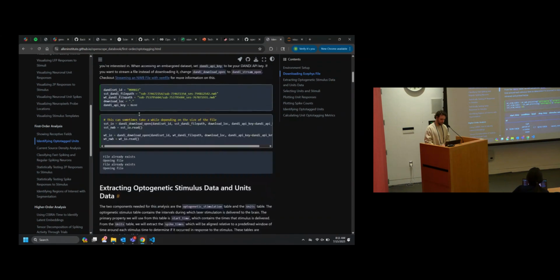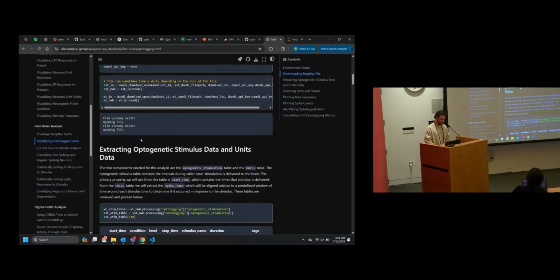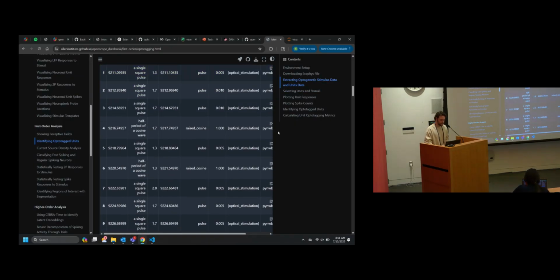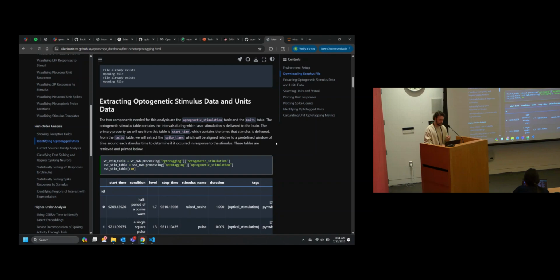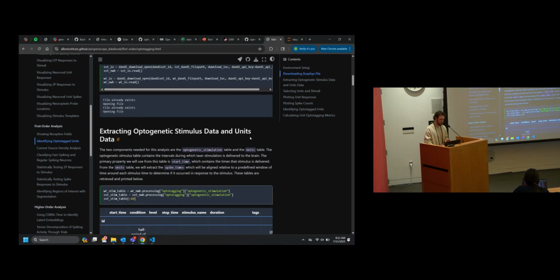This is also, I think, a visual behavior data set. The reason I'm showing this notebook is because opto-tagging is important for this type of research if you're trying to identify particular cell types. But the other reason is that it has a good code example of getting event-aligned responses, which is used in a ton of different types of analyses, not just opto-tagging.